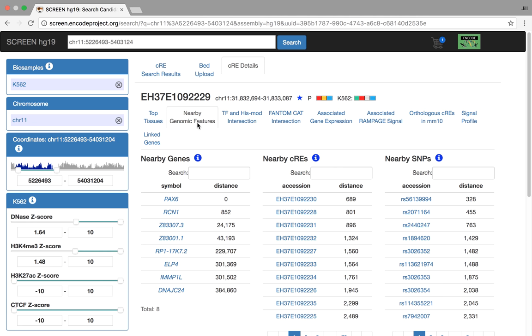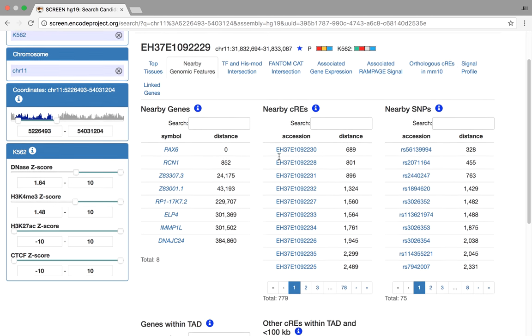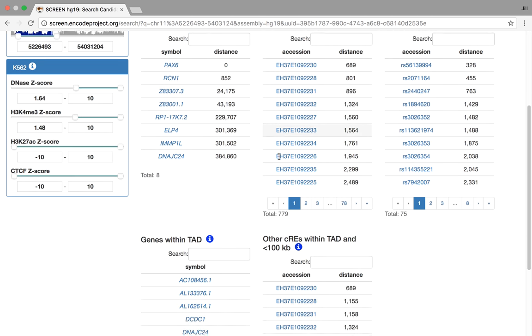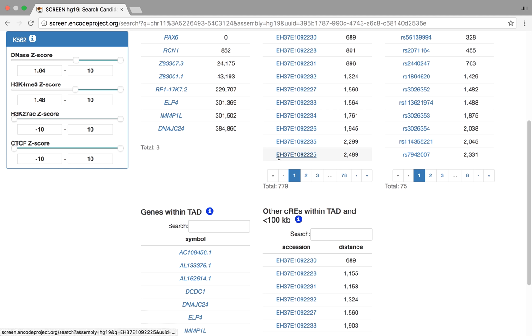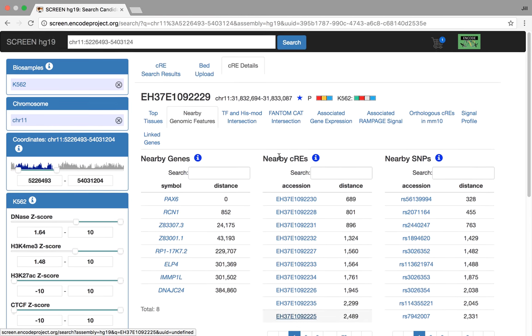The next tab is nearby genomic features. So nearby genes, other CREs nearby within a certain window, other SNPs that are nearby. And these are also searchable and browsable. We're also showing you other genes in the TAD that the CRE is in, as well as other CREs within that TAD with a certain threshold, certain cutoff for distance.